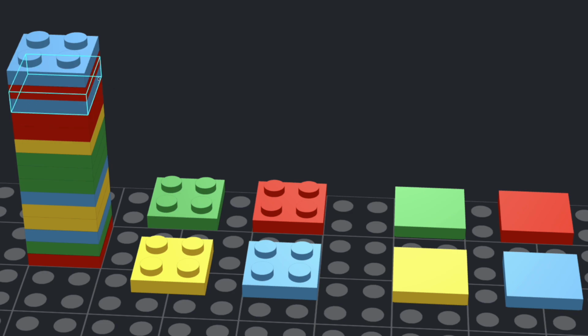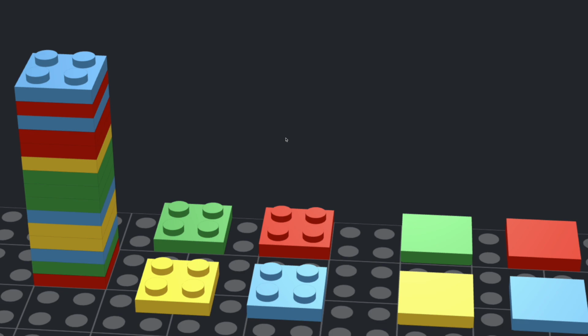Okay, so here we have some Lego bricks, and these ones here on the left represent a DNA sequence that we've amplified. And basically in a Sanger reaction, these individual bricks here represent dNTPs, and these ends without studs on them represent ddNTPs. And we know that the dNTPs contain the 3' hydroxyl group, which allows for extension of further bases after each consecutive base is added on.